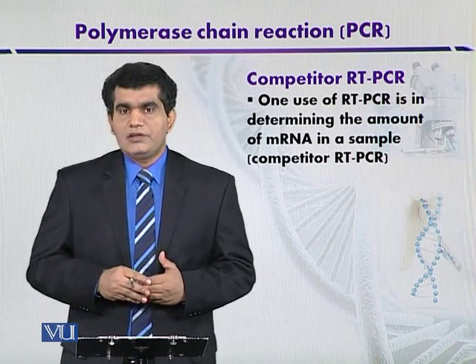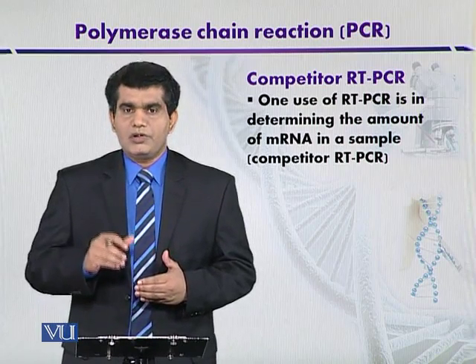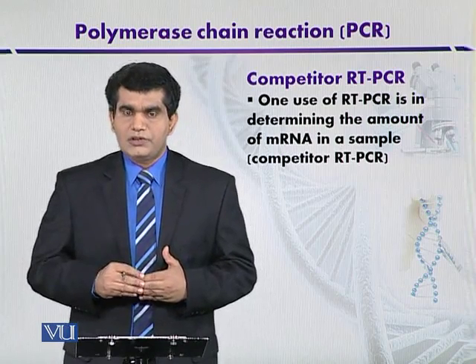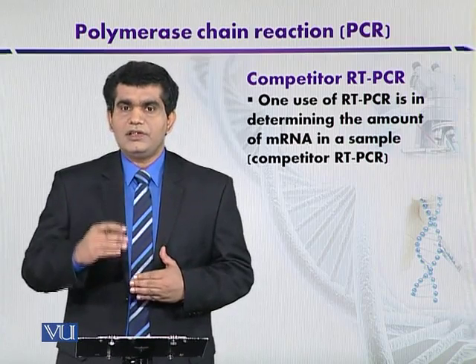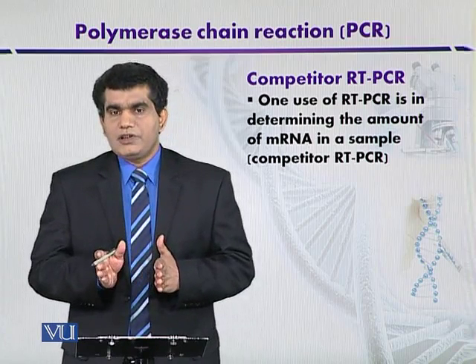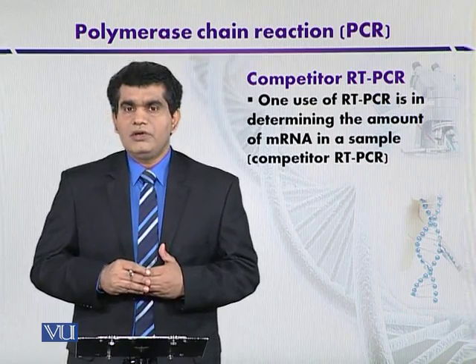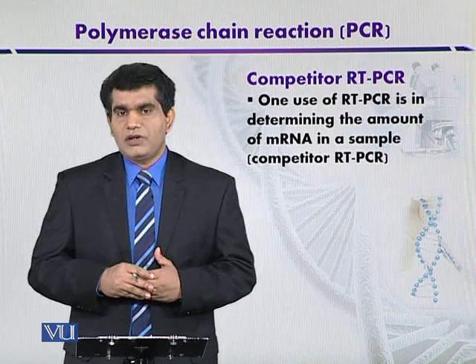Another application is that it can be used to quantify the RNA molecule, either from certain tissues or in certain PCR reactions. So during the extraction process, this synthetic fragment of RNA, which is competitor RNA, it is added during the extraction process, and by calculating the ratio of the competitor RNA in comparison with the target RNA that we have extracted from the sample, so we can determine the losses of the target RNA. So this is also one of the application.